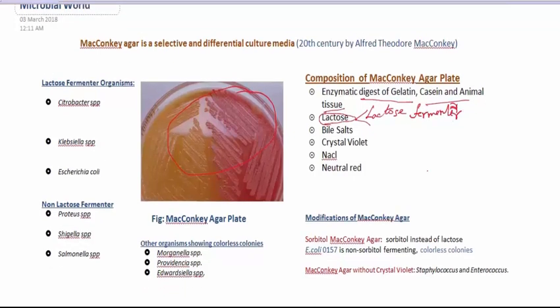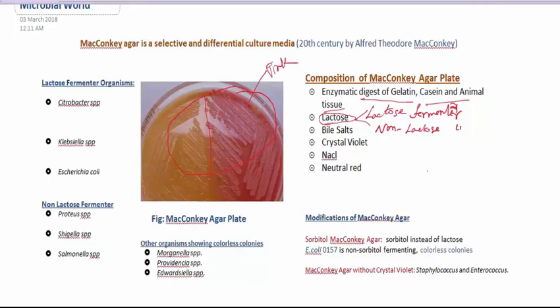Lactose fermenting bacteria have the ability to change the color of the media from red to pink — you can see the pink color here. Non-lactose fermenting bacteria, as they can't ferment lactose, show colorless colonies.